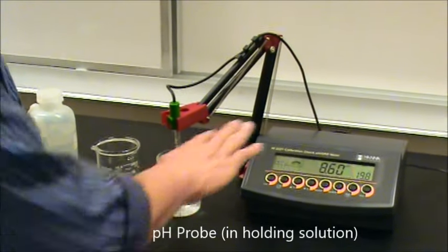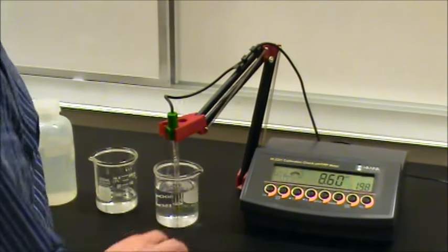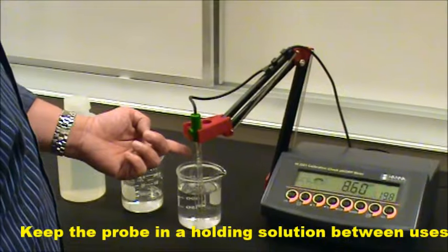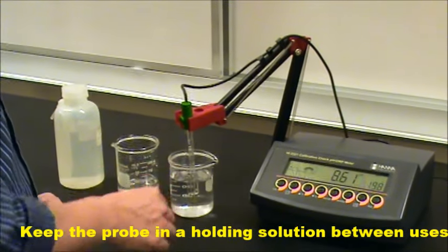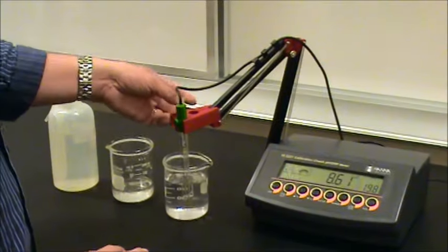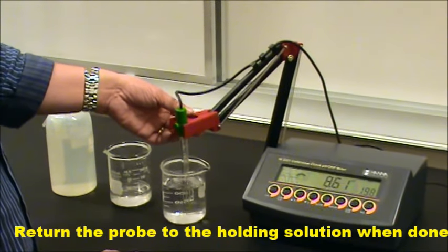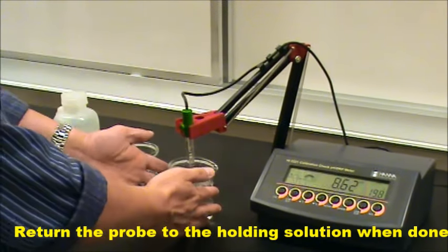First, when you come up to the pH meter station, the probe is going to be immersed in some kind of holding solution to keep the tip of the probe moist. When you're finished using the pH meter at any time, you want to make sure you immerse it back in the holding solution.